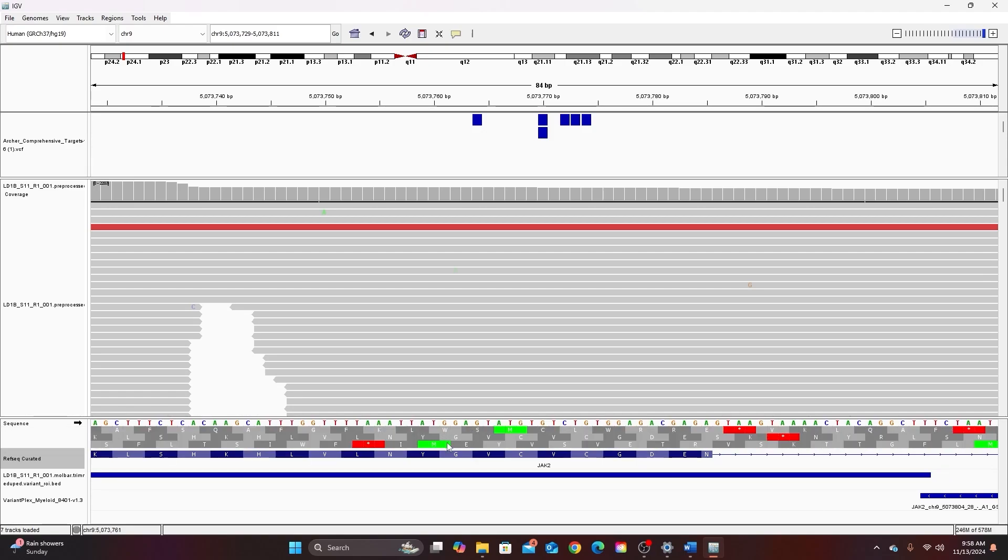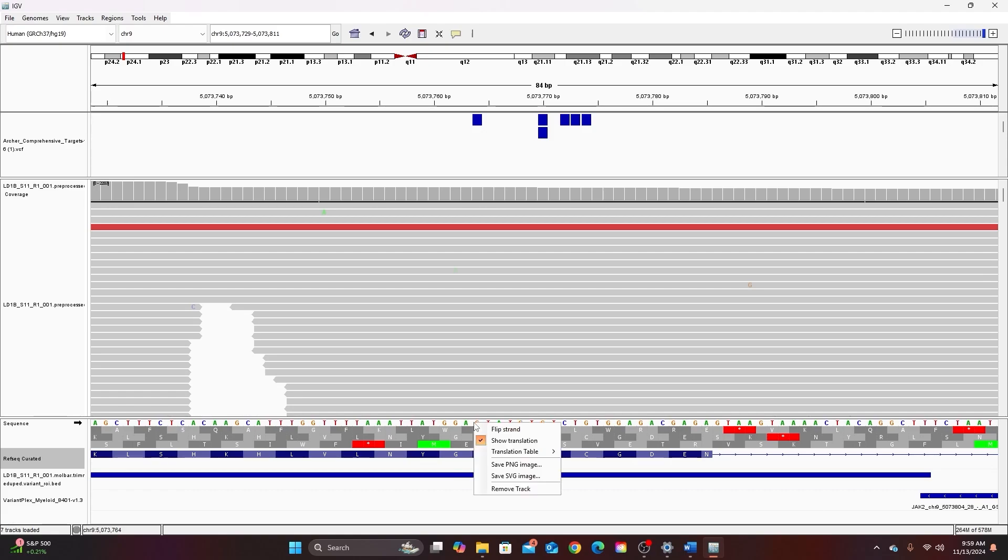Now sometimes none of the amino acid translations for the three frames in gray here will match the translation of the reference genome in this bottom track. And this is because the reference is the actual translation of the gene which might actually be encoded on the minus strand or the reverse strand. So in that case to get them to match you would want to right click on the reference DNA sequence and select flip.